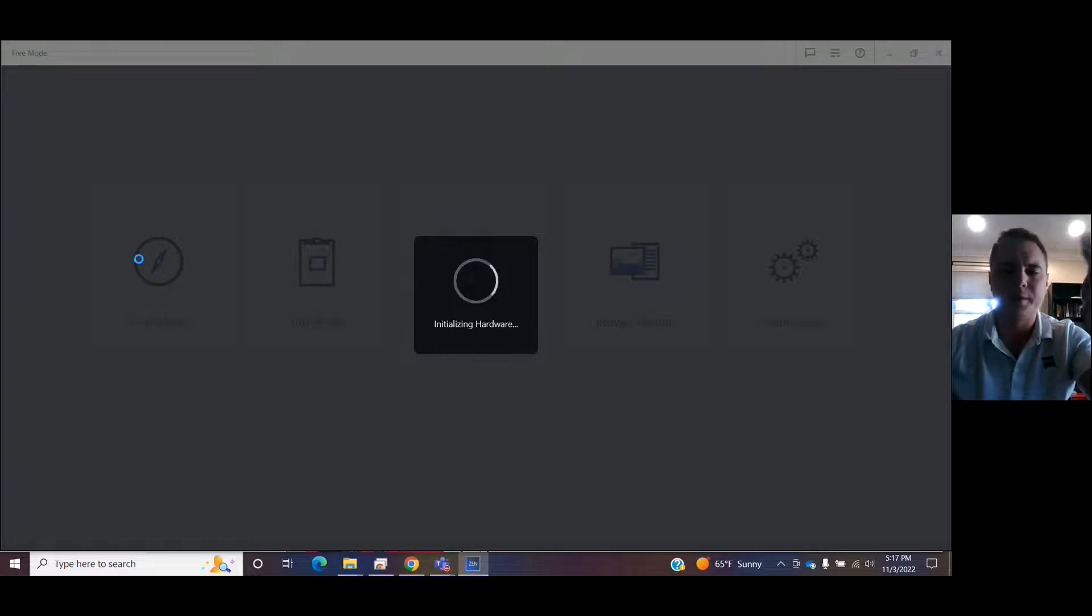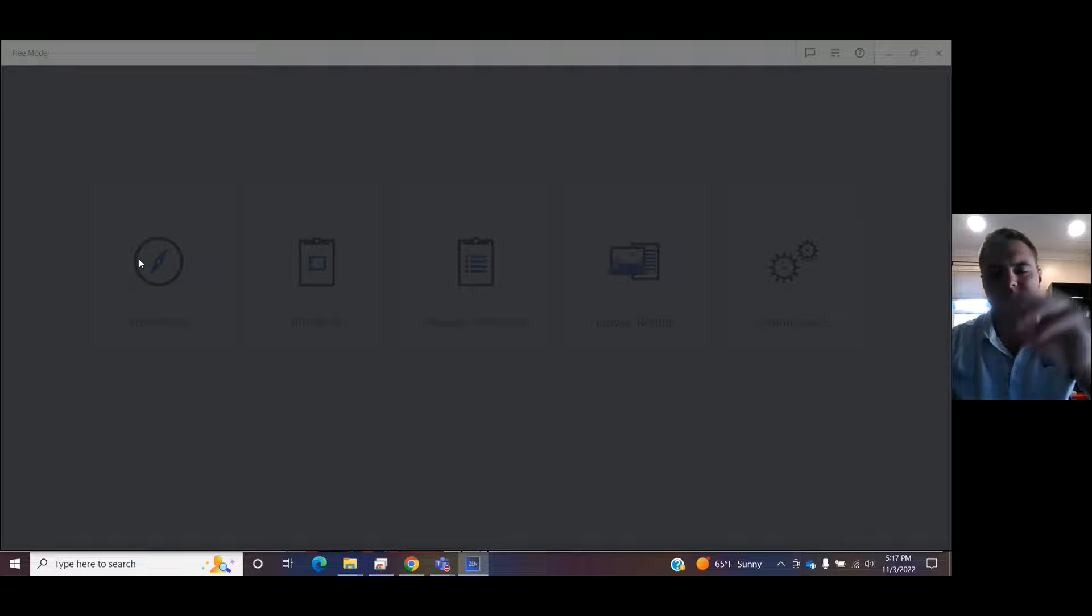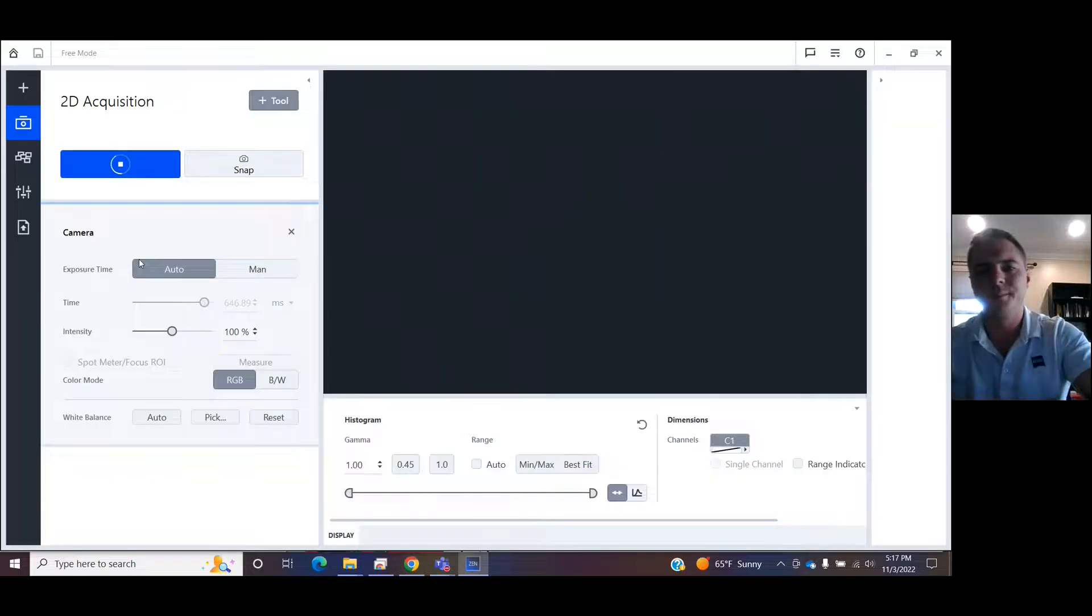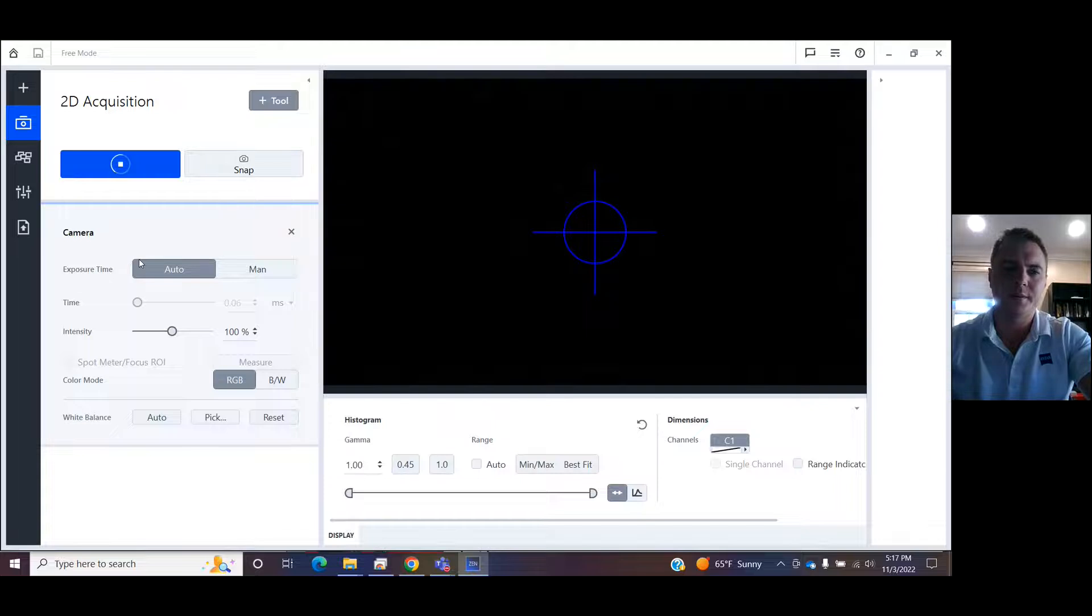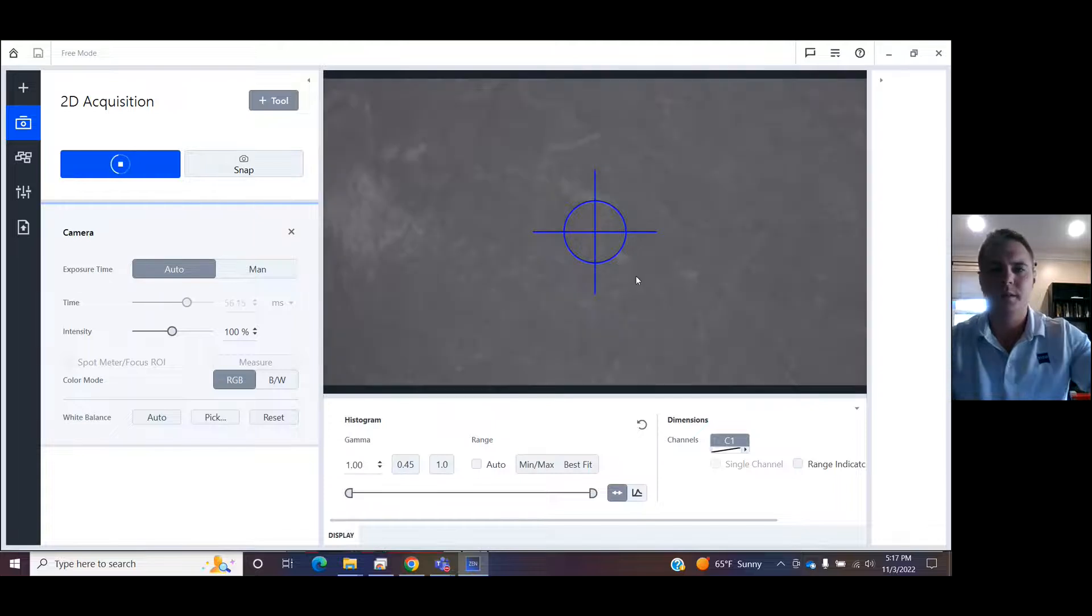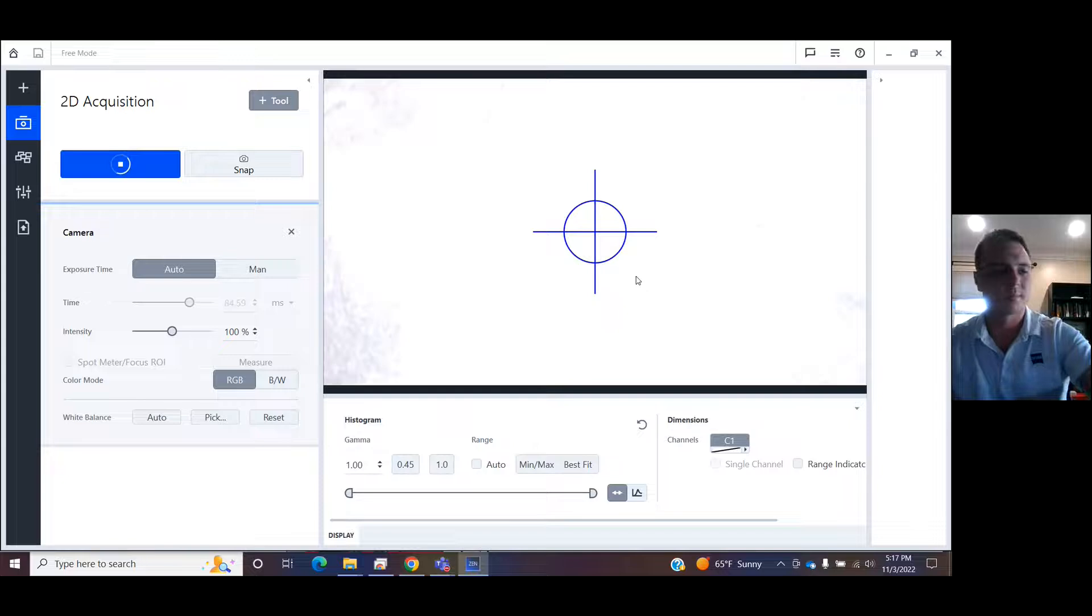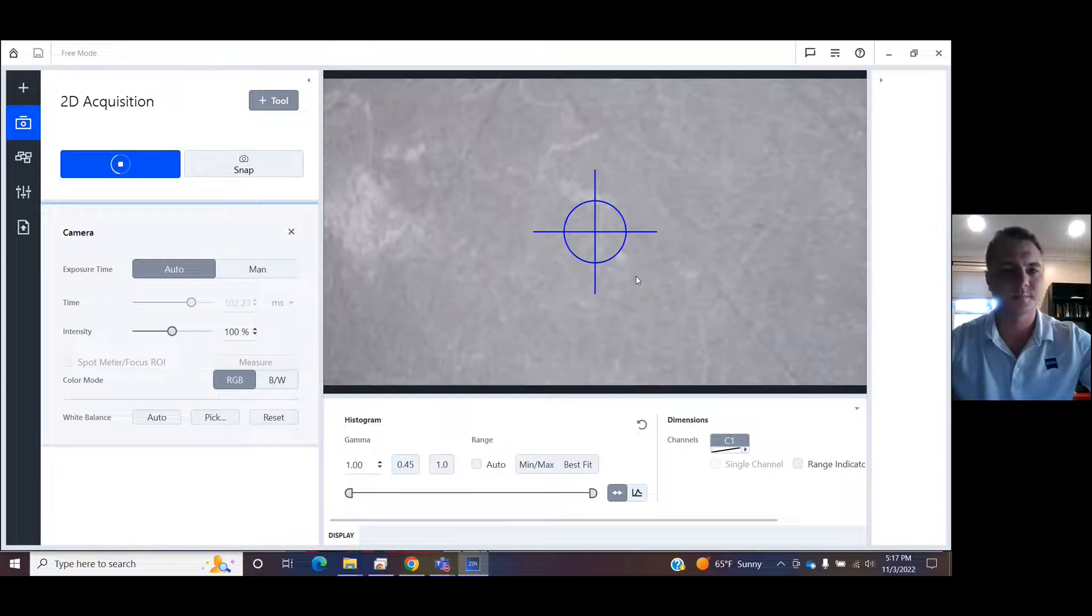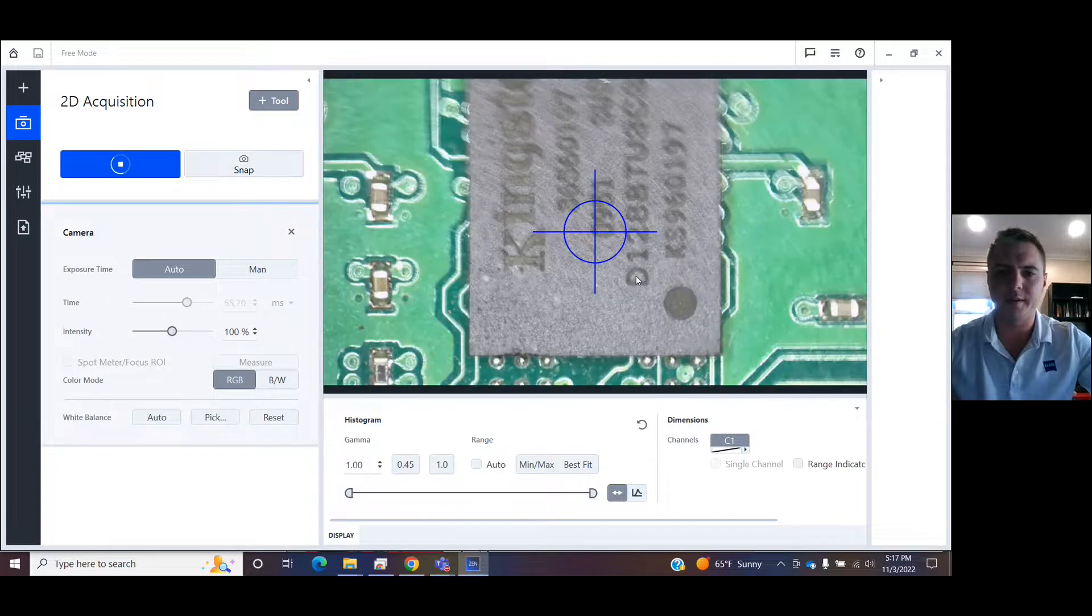Looking at a printed circuit board sample, play with exposure where the images go. So our live image right there. Watch my hand under it, just fine. And we will put down our sample.